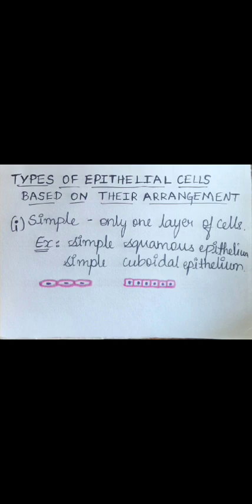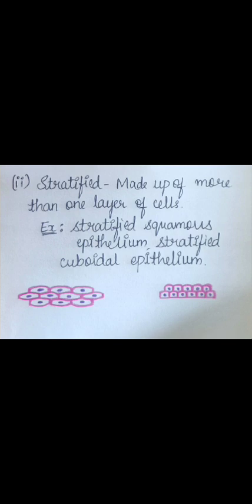Stratified epithelium is composed of multiple layers of cells, and it provides protection against mechanical stress and abrasion. They are found in the skin and the lining of the mucous membranes and esophagus.